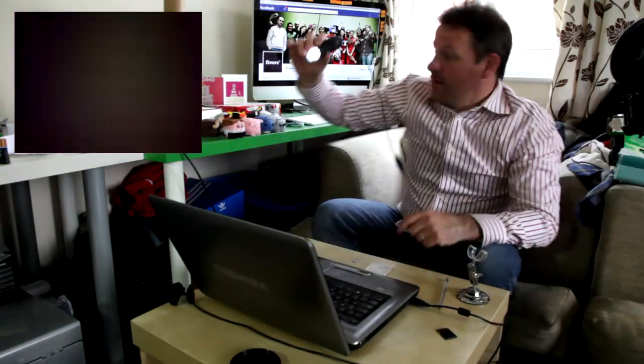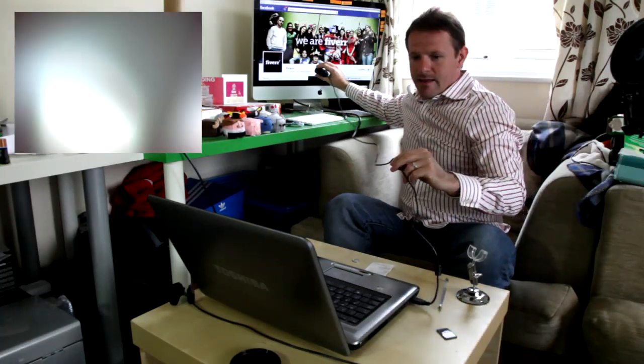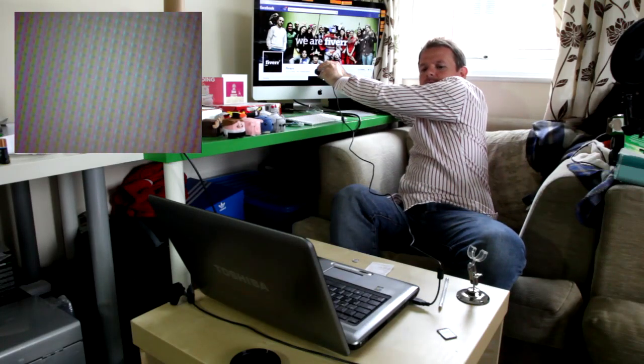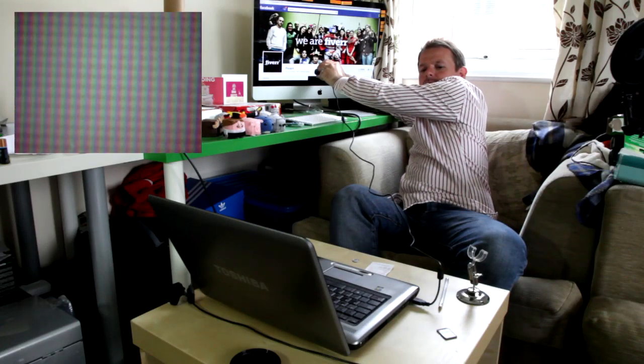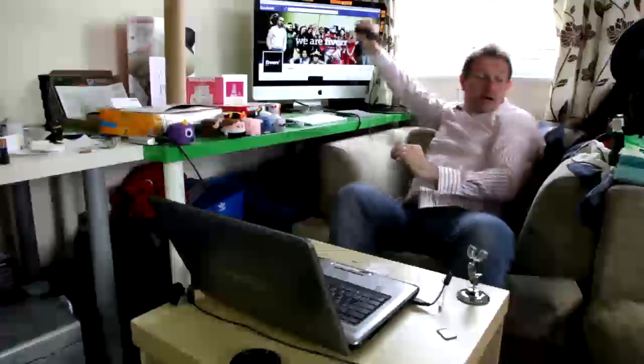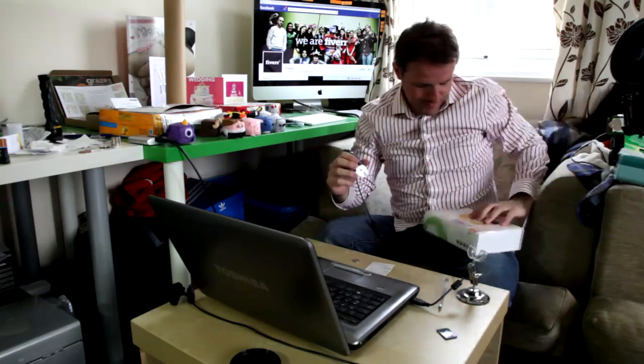For example, I'll place it on this one here — this is a Mac screen, so it'll be slightly different. Focus there — look, just the same. So it arrived in this box, digital microscope.